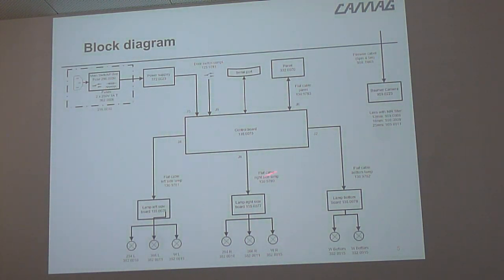The reason for such things is that even the Visualizer is one of the newer instruments in CAMAG terms. It is now 10 years old. It's 2006. So if you design an instrument, you take parts that are well known, and in 2006 they were well known. So now the parts are 15 years old, and some of the parts had to be replaced.